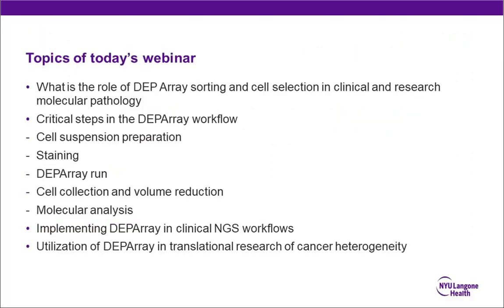So what we'll be talking about is what is actually the role of DEPArray sorting and cell selection in clinical and research molecular pathology. I will review with you critical steps in the DEPArray workflow, focusing particularly on cell suspension preparation, cell staining, how to perform a successful DEPArray run, and then talk about cell collection and volume reduction, molecular analysis, and how to implement DEPArray in either clinical NGS workflow or how to utilize DEPArray in translational research and cancer heterogeneity.